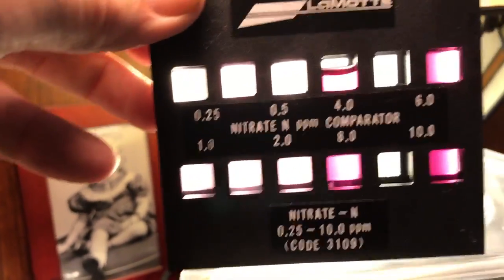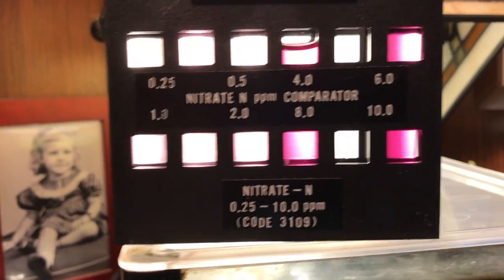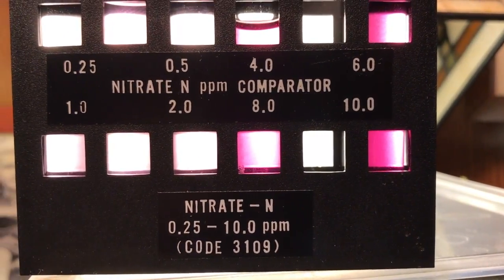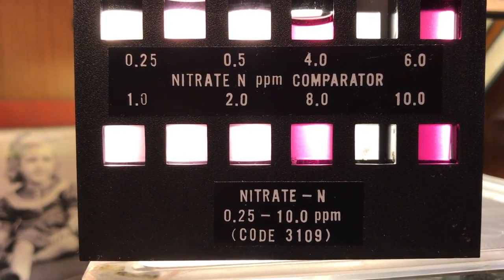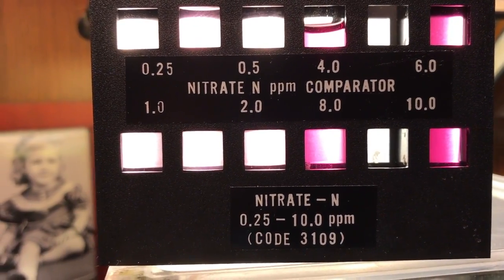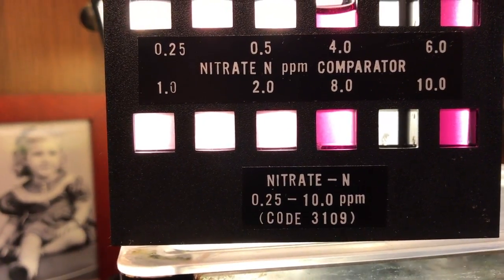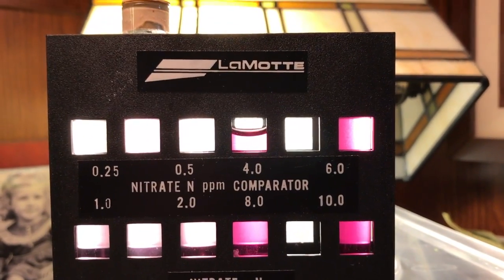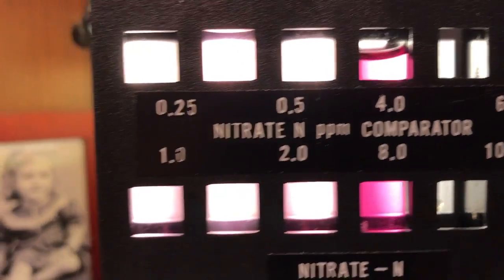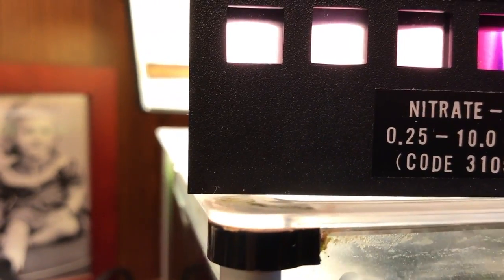There's the four — look at the four reference. Four parts per million is a lot darker than the one and two. Once you get to eight, or even six — look at how dark six is. This aquarium is running at 1.5 parts per million of nitrates after nine months using biocenosis clarification baskets. I've had people come to my pond — DVMs — and bring Lamotte kits. I apologize for the lighting, this is the best I can do, but you can see by the one and two references.